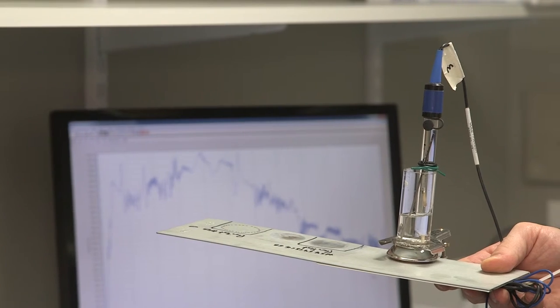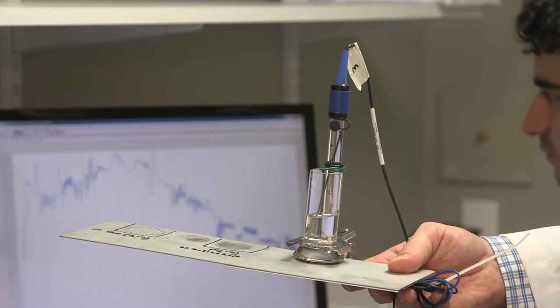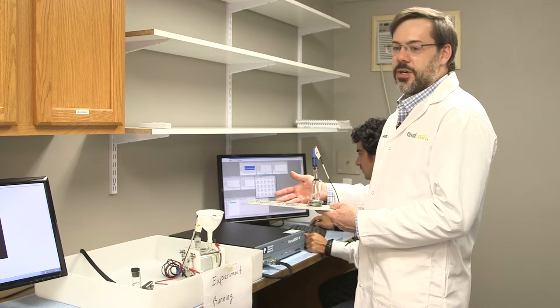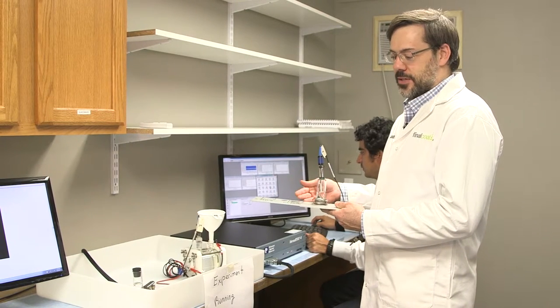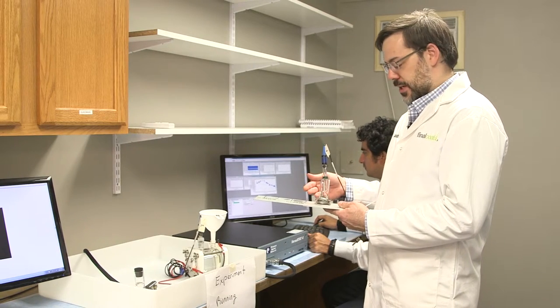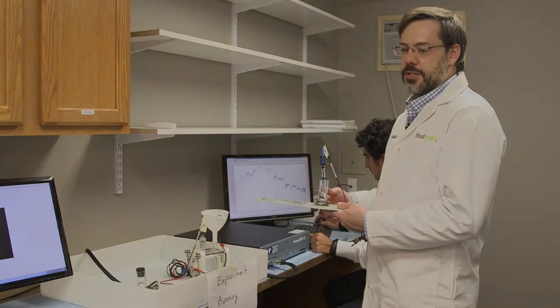This is one we call a vertical cell, which was used for an experiment just finished. These are but two varieties of cells that we may use. These are pretty much off the shelf cells, but we also have some that we designed for very specific experiments and have made in the machine shop as needed to fulfill very specific needs.